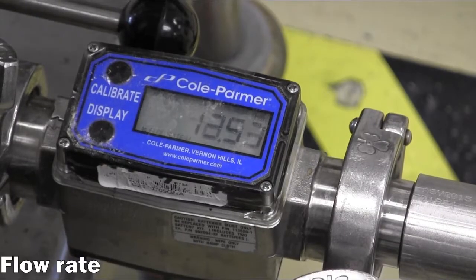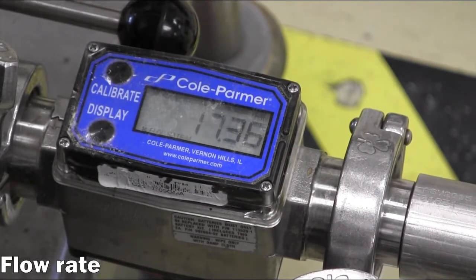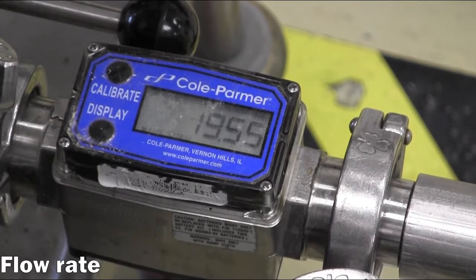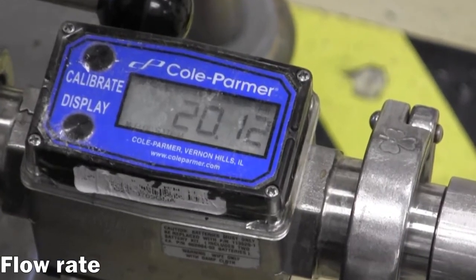The flow rate can be monitored via the digital flow meter near the feed inlet port. Take care to monitor the inlet pressure while adjusting the flow rate to not exceed manufacturer specifications, which may damage the membrane.